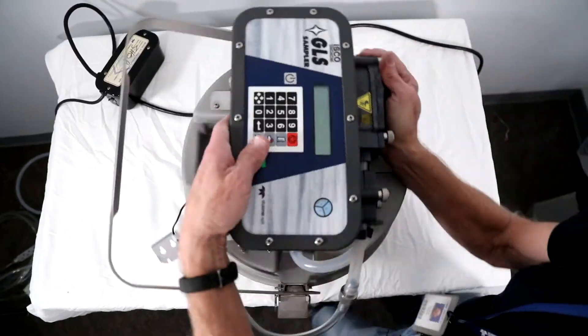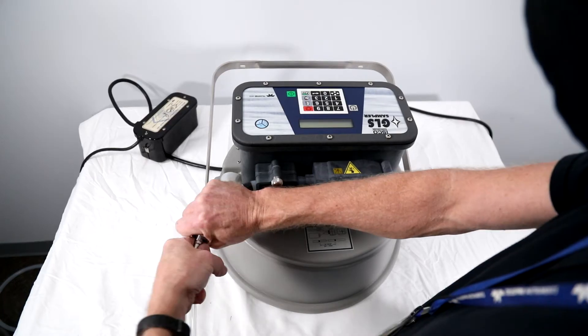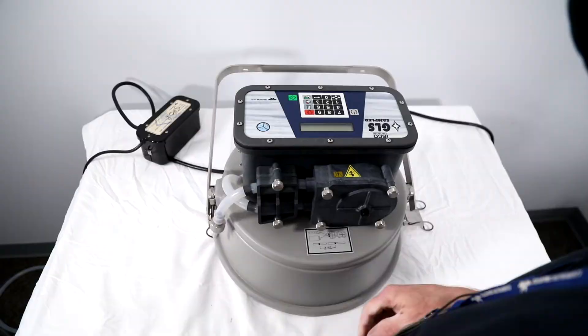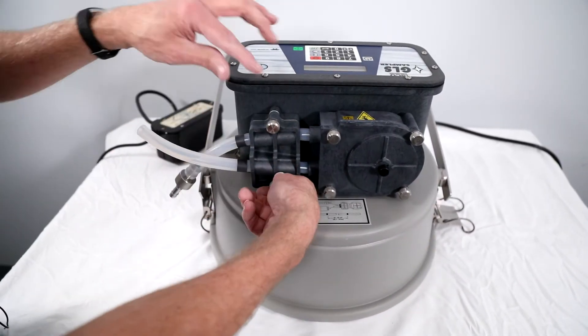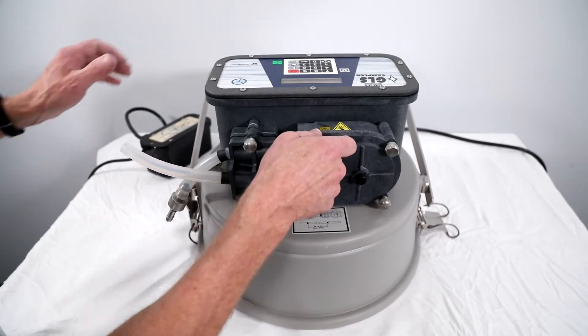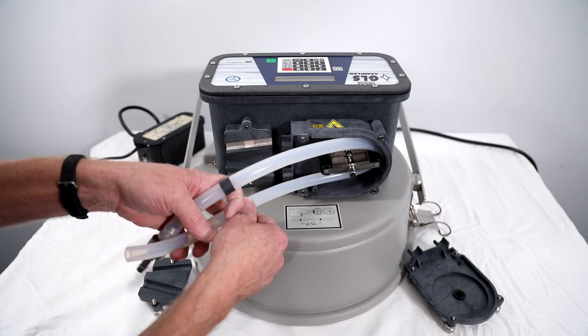Remove power from the GLS. Notice the tubing routing guide located on the center section. Remove the suction line from the tubing coupler and pull the other end of the pump tubing off of the bulkhead fitting. Loosen the thumb screws to remove the liquid detector cover and the pump housing cover. Remove the pump tubing from the GLS.